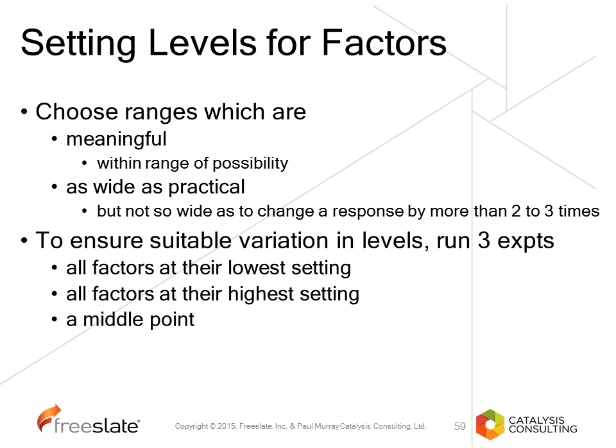If the lowest and highest settings give you the same results, then that tells you that the settings are not different enough from each other to achieve the result that you want. And the midpoint gives you some indication of the direction of travel. So it is good practice, particularly if you're not using automation, to carry out the factors in this way. That means you can get some information and be sure that you've chosen the right ranges for your factors before you carry out the rest of the design. So you've only carried out 3 experiments rather than 11, 19, or 35.